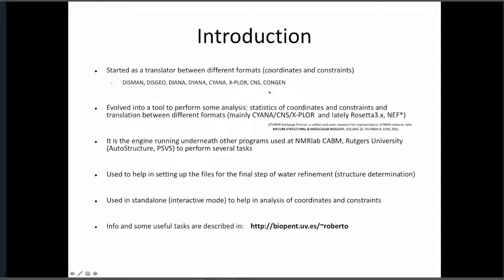Then it evolved into a tool able to perform some statistical analysis, mainly what people ask me to do. Lately there has been a lot of use of it just converting between different formats, like from CYANA to CNS for doing water refinement, and then to Rosetta, and then the latest format, the NMR Exchange Format, that was published last year, 2015.